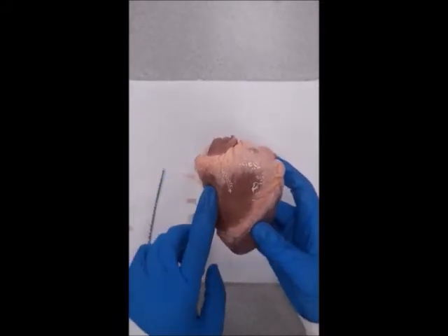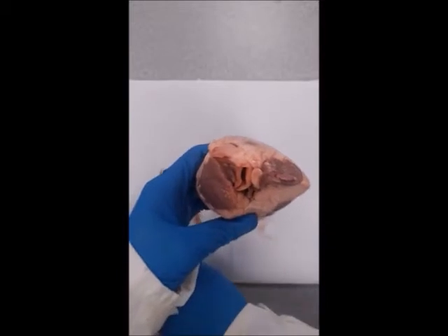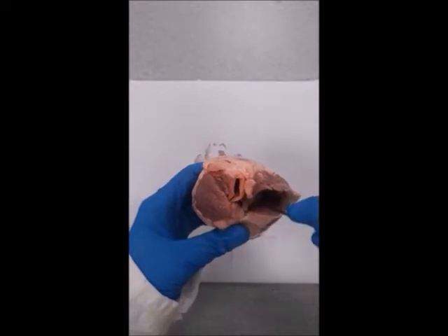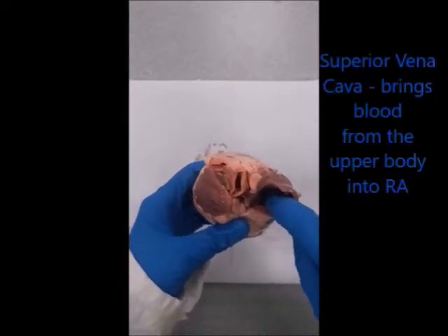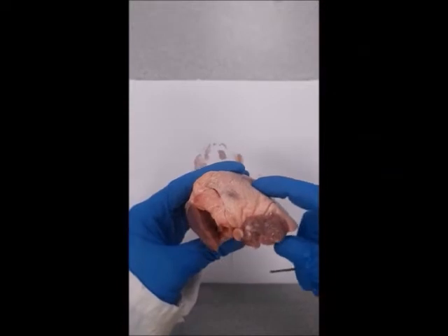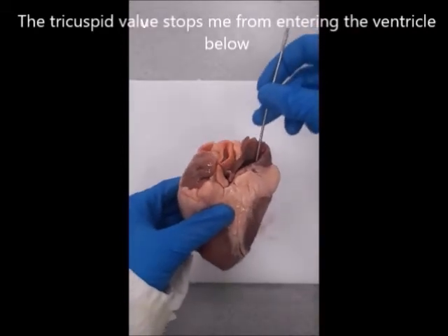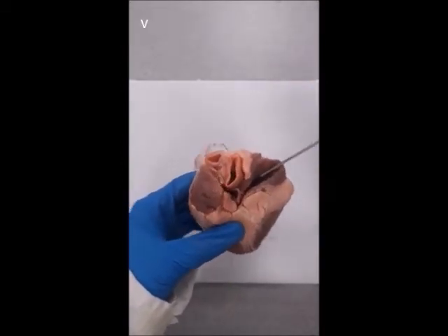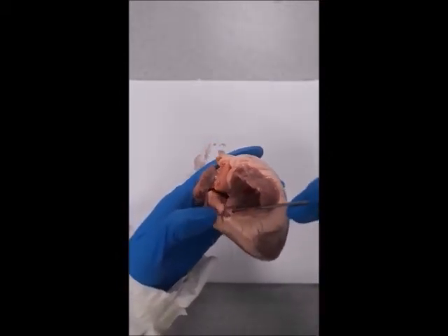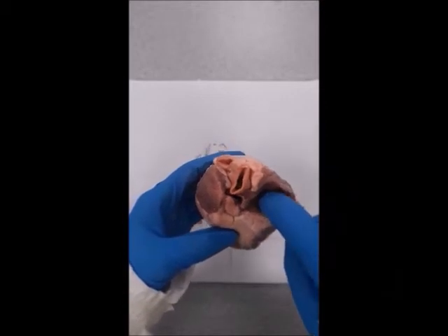We're going to turn it now so that the right side is on the right-hand side, looking the same way we're looking. This large opening is the superior vena cava — it brings blood from the top half of the body to the right atrium. The atrium, or atria, are the top chambers of the heart. If I stick a probe down into the vessel, I can feel that it's open but it only goes into that top atrium. Just to the left, coming off this, is the inferior vena cava — it's much smaller and brings blood from the bottom of the body to the right atrium.